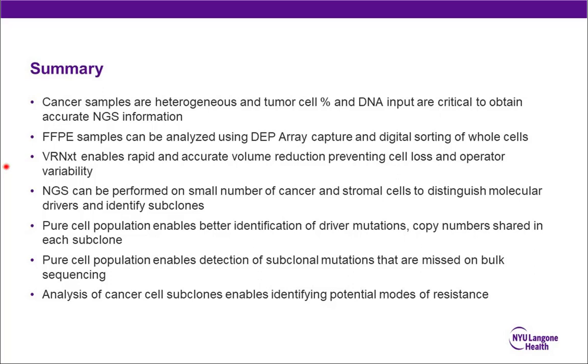Will this work with slides? I cannot answer that question very well because we tried to recover cells from a 10 micron slide. We are able to recover some material, but as you remember from my picture with the cells, when you slice them you really get just fragments of nuclei. So I don't think slides are a good starting material.